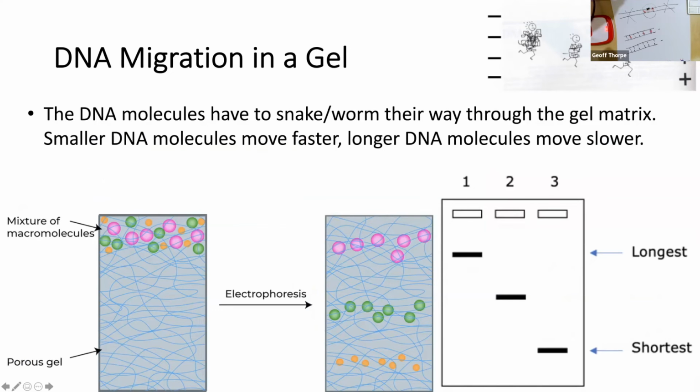So a little bit more about why it moves that way. Firstly, at the top right, I've got this little picture just to try to show that the lightest, smallest DNA molecules, let's imagine they can run the fastest. Whereas the DNA molecules that are very long, we could say that they're heavy, they can't run so fast. The ones in the middle will be in the middle.